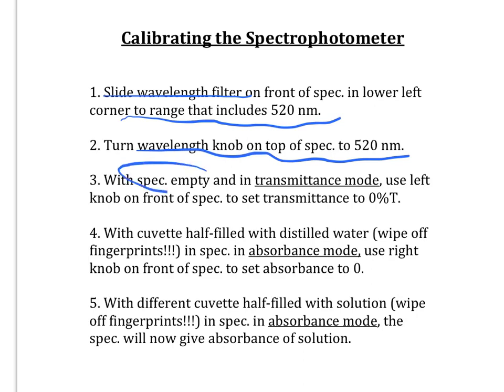Step three, when the spectrophotometer is completely empty, meaning there's no cuvette in there, no light is getting through. So, in transmittance mode, if you use the left knob on the front of the machine, you should set it to 0% transmittance to let the spectrophotometer know that no light is getting through when there's nothing in the machine.